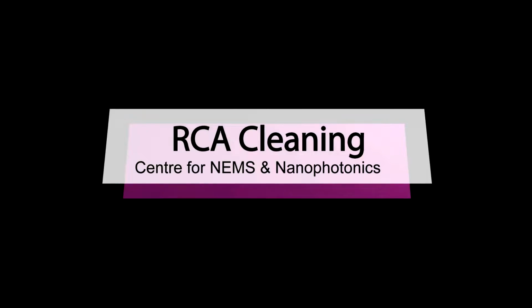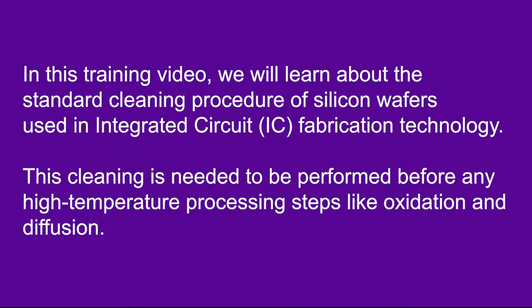RCA Cleaning. In this training video, we will learn about the standard cleaning procedure of silicon wafers used in integrated circuit, that is IC, fabrication technology. This cleaning is needed to be performed before any high-temperature processing steps like oxidation and diffusion.